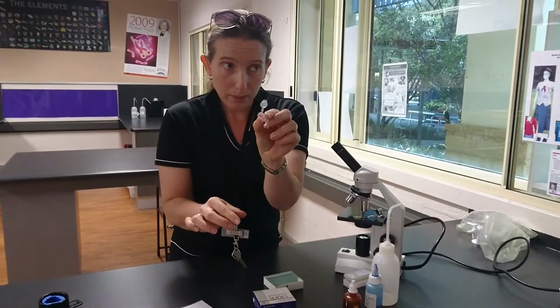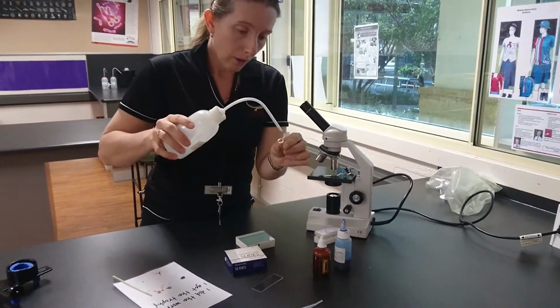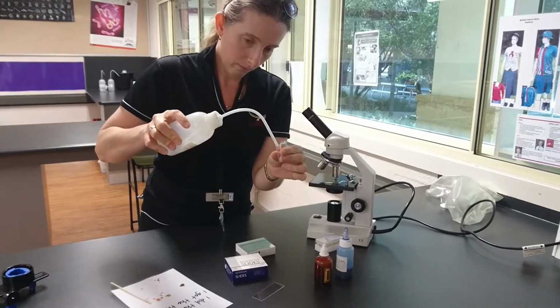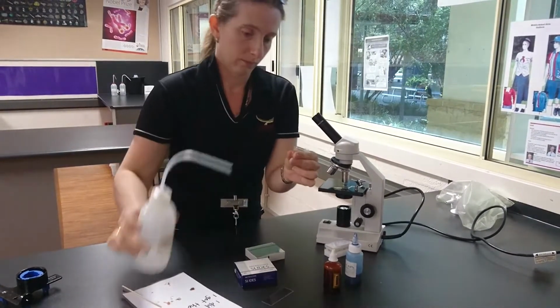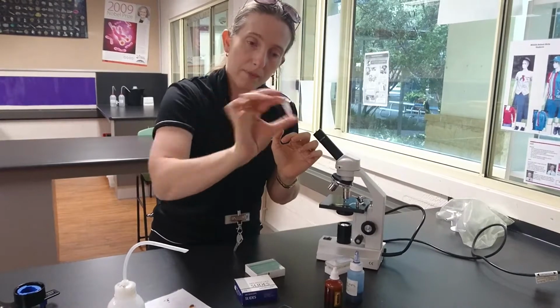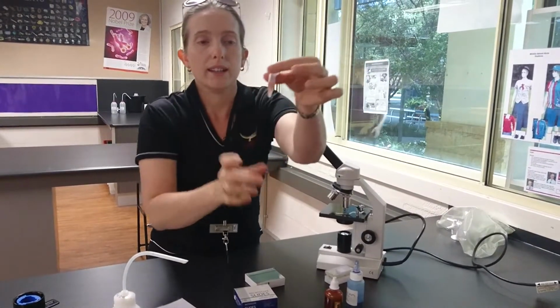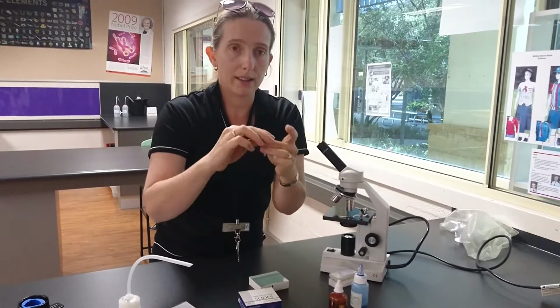So you need to put a sample of food in this little Eppendorf tube, half fill it with water, don't fully fill it. And clip it together and give it a little shake like that. Now that will make a suspension like this. Makes it a lot easier for us to put them on slides.